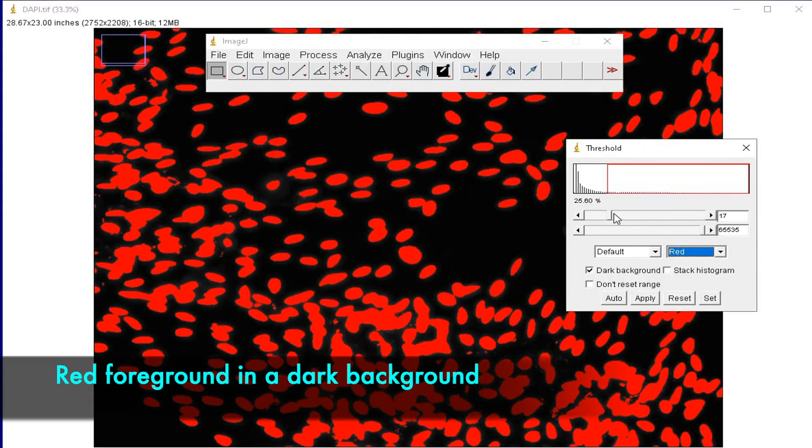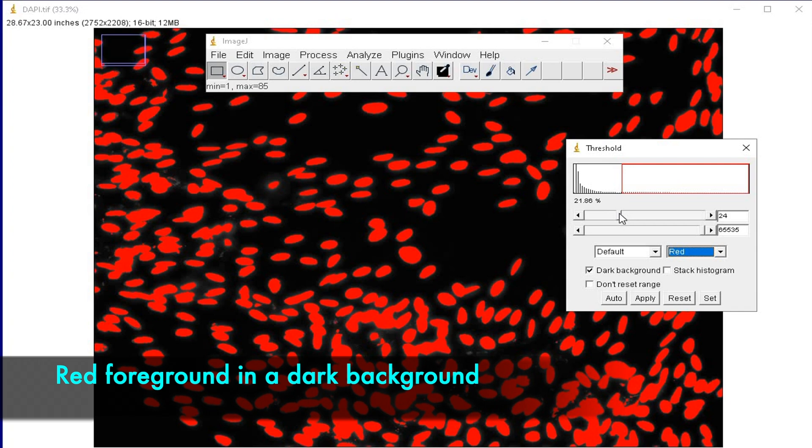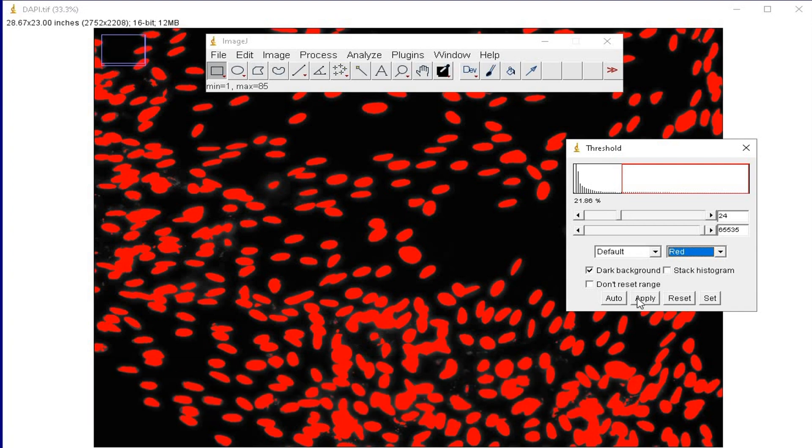The slider can be adjusted until all the foreground is completely red in color in a dark background. And then click Apply.